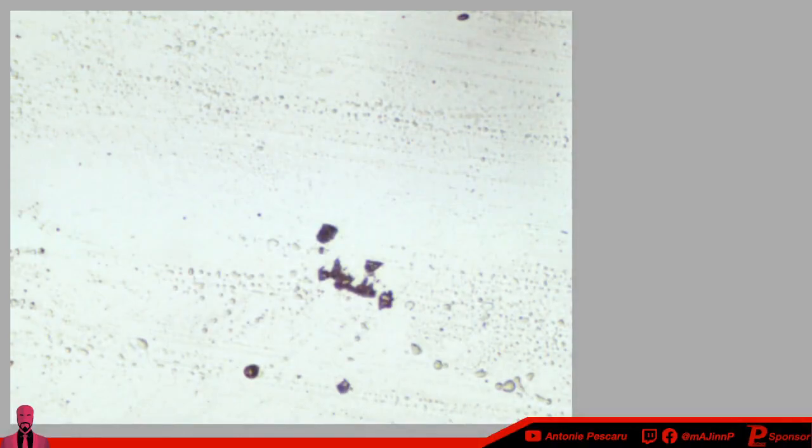Okay, so it is working. I do have image, but I just don't really have anything to look at, which is weird. Oh, there we go. There's images. Perfect. So the light is basically at 1. We got basic light, and I think I'm going to change it to a different lens.